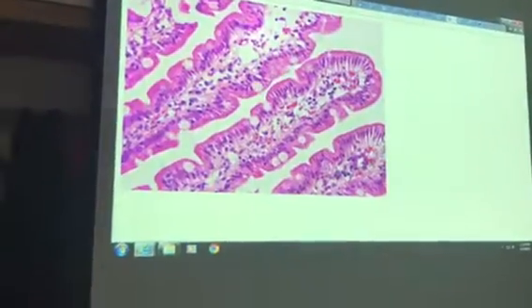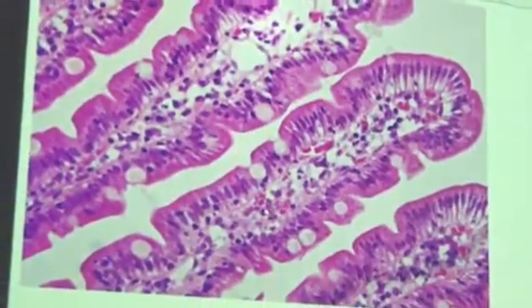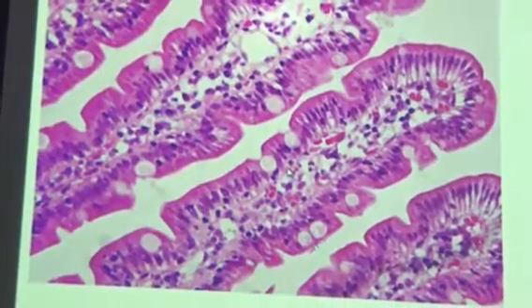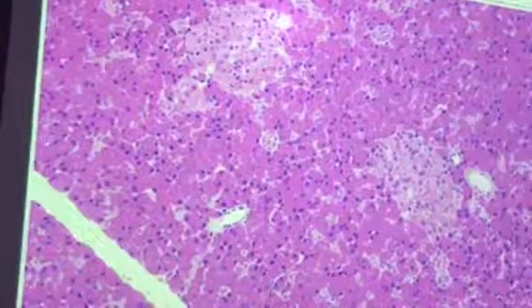This is just a close-up showing you some of the villi up close. All right. So the outer part is the epithelial layer. Stuff inside would be the lamina propria. What are these circular things again? Those are more goblet cells. Remember, goblet cells are all over the place. You have them in the respiratory tract. You have them in the digestive system.